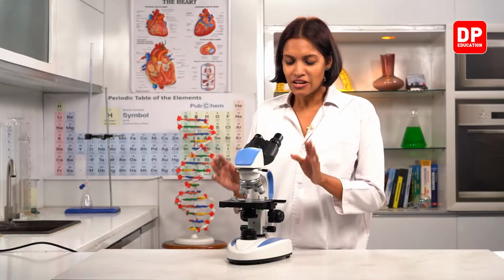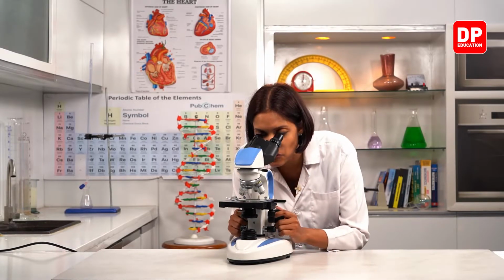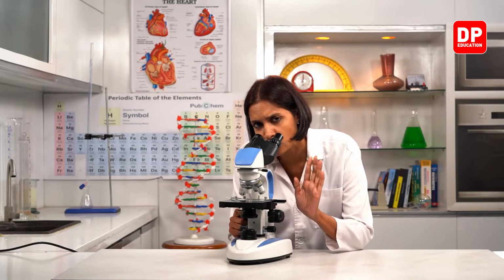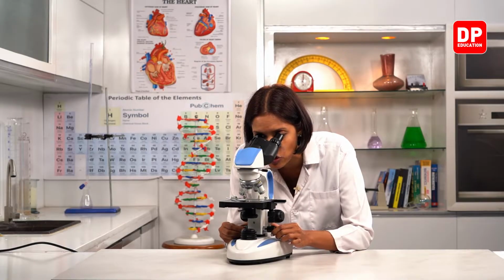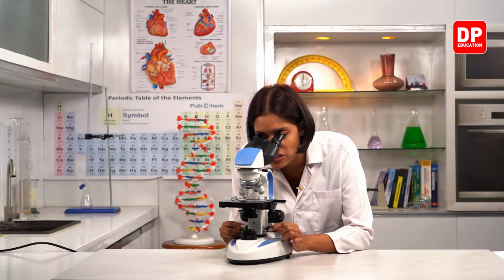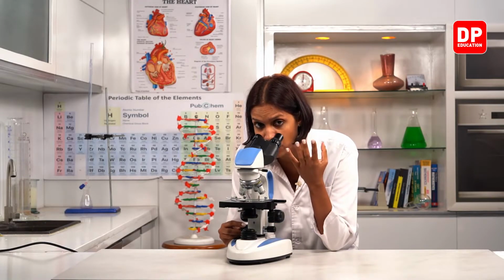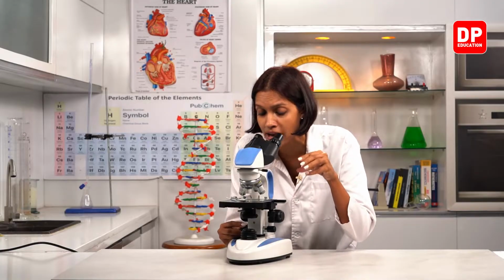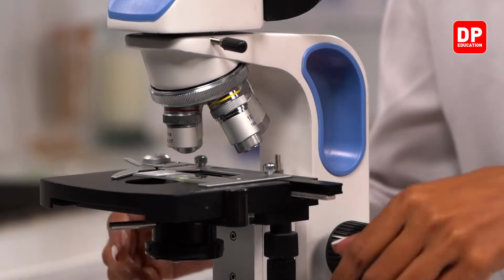Right, children? Now we need to observe our specimen using the microscope. So in order to get a clear image, we can use the fine adjustment knob, right? And if you want to get a larger, better view of the image in a certain particular part, then we can change the objective lens, right?